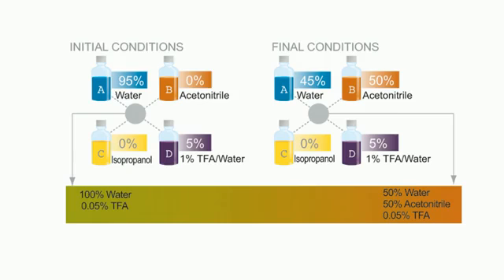When we prepare solvents for running analytical chromatography methods, we typically make a mixture of water, organic solvent, and some typically ionic modifier, and we make a strong and weak, or an A and a B solvent. With the auto blend technique, instead, we use bottles of pure solvent and concentrated modifier to prepare any composition that we desire.